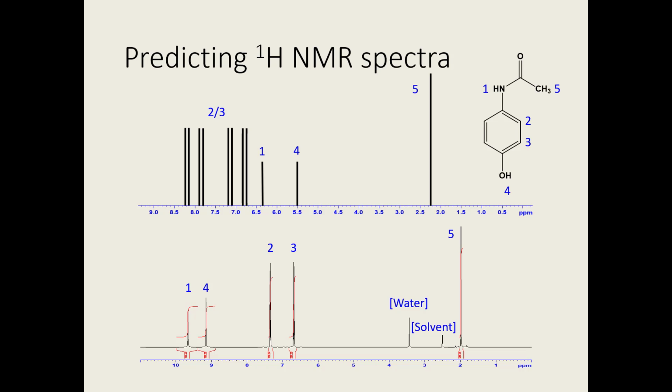This is the proton NMR spectrum of the product, paracetamol. Again, all of the signals have the correct integration and multiplicity. The OH and NH protons are slightly outside the predicted ranges. This could be due to inductive effects within the molecule.